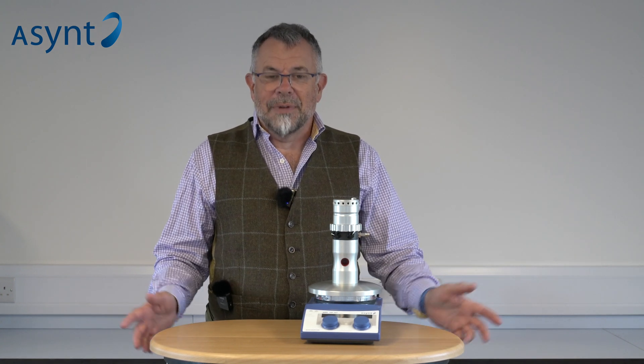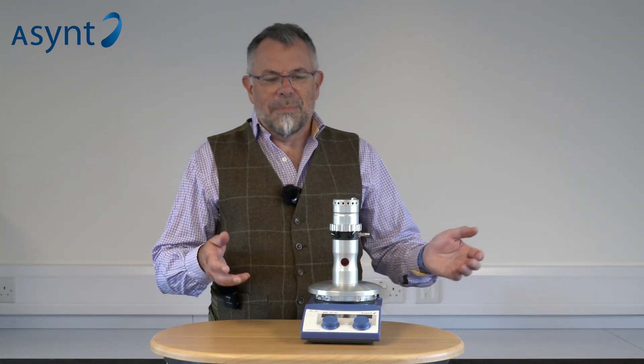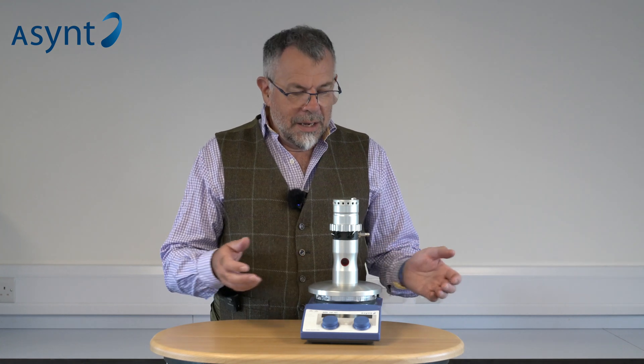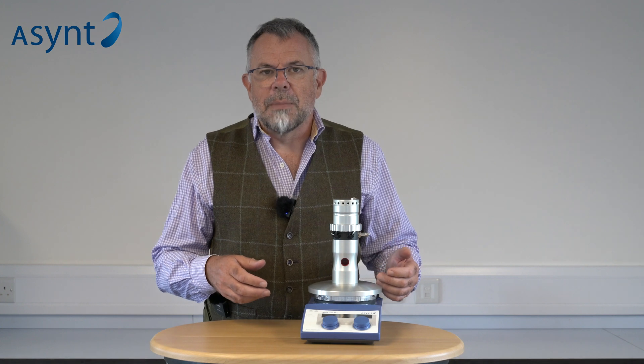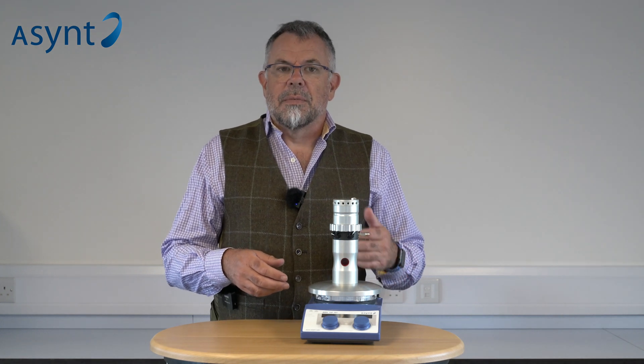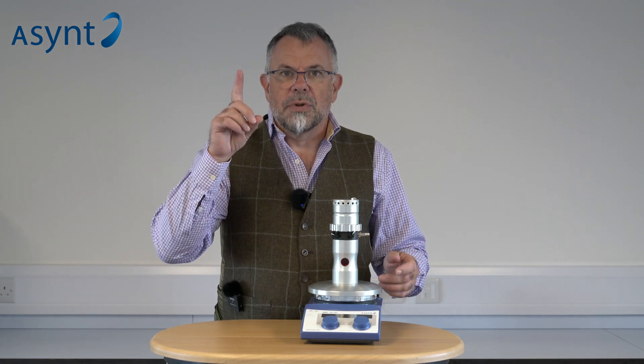Welcome to Asyn. My name is Martin Fordham and today I'd like to introduce you to our latest product. This is LightSyn Lighthouse. What is it? What does it do? Well, the term light might give it away as a photoreactor. It's using some novel ideas we came up with a few years ago. A little bit of history to that development and how we got here — please watch the video above.